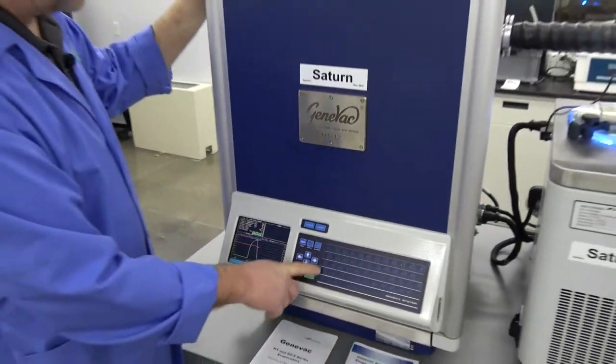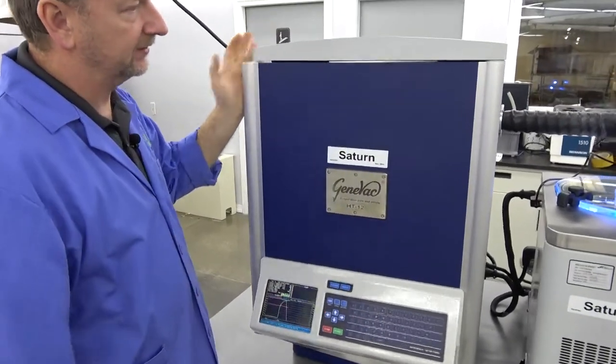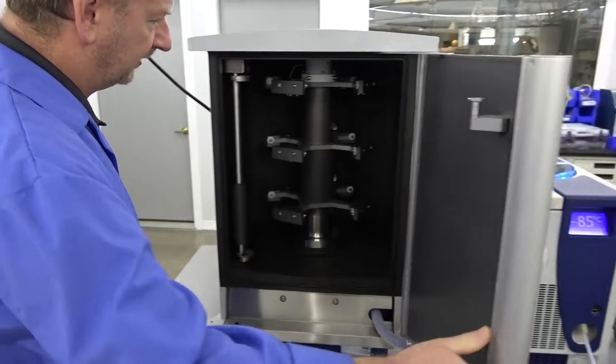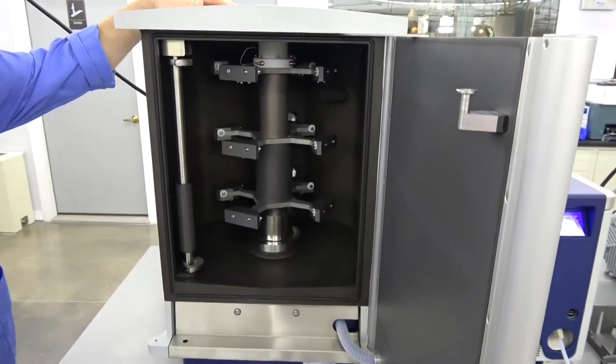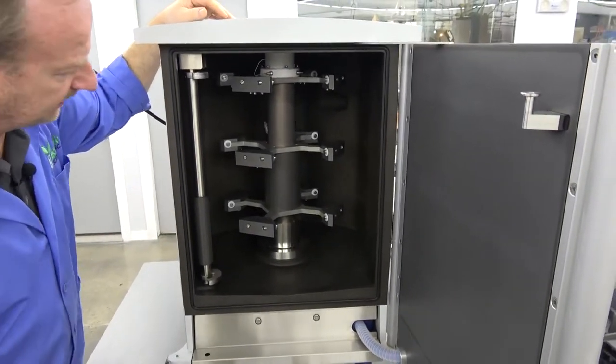But really nice and easy. You just hit the open button and voila, it opens right up. But I just want to point out how beautiful the inside of this thing is.